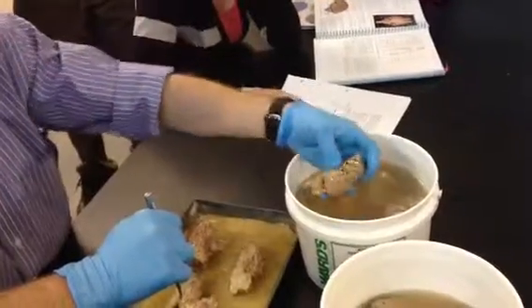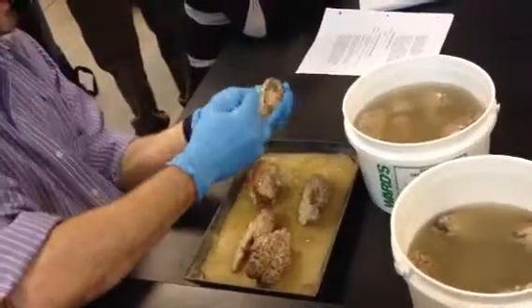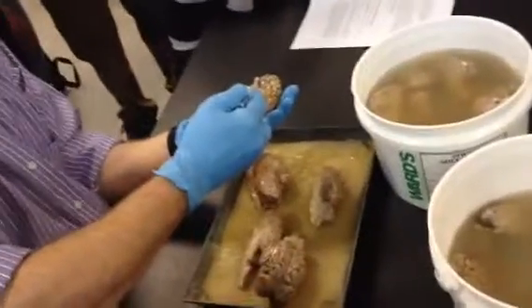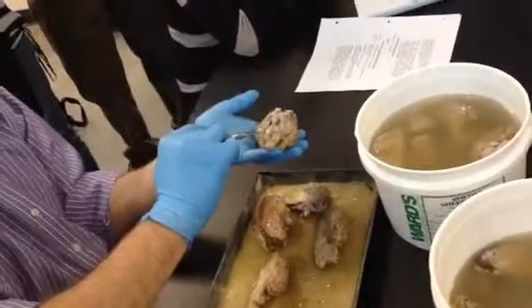Starting with the dura mater. The great thing about the dura is it's pretty easy to tell. Remember we said tough mother? So this is the white dura mater. If I were to tag it, I could put a pin in it or a tag on it, you can see that's dura mater right there, the white stuff. Okay, next one.